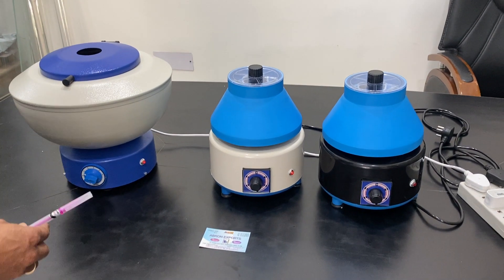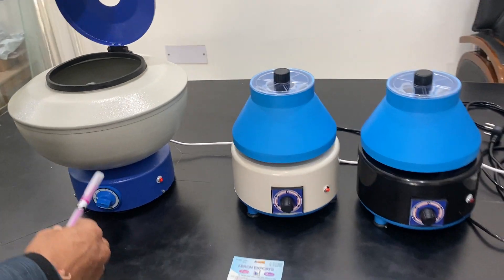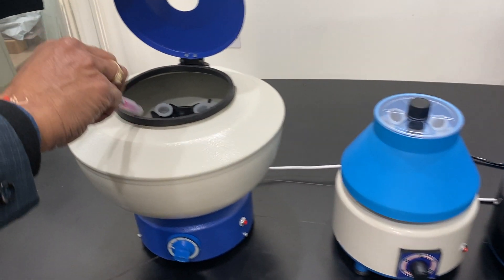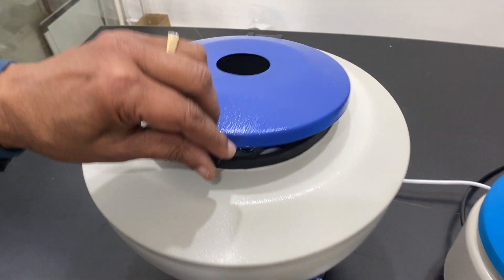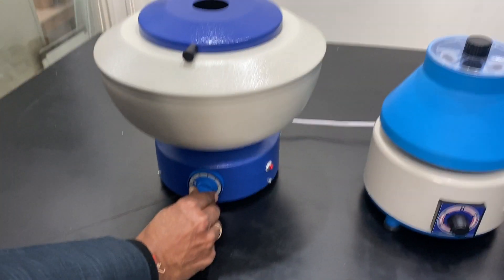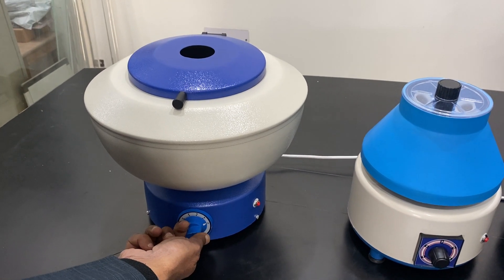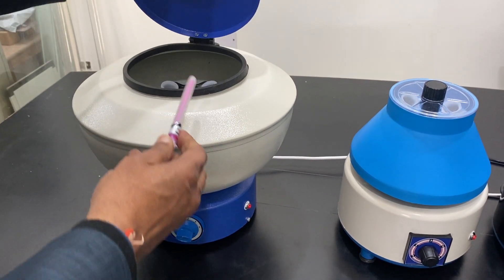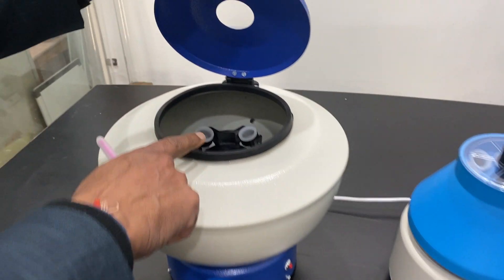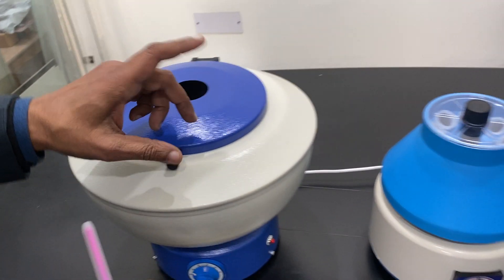Welcome to another video by Abron Exports. These are centrifugal machines for lab cleaning or demo. This is a four-tube dome-shape machine with four-tube capacity. We have another model with eight-tube capacity also. The speed is done in one or two steps, and the maximum speed it can take is 3500 RPM.